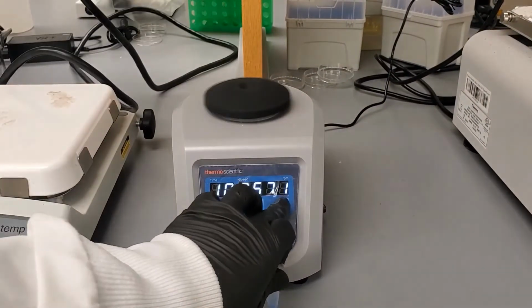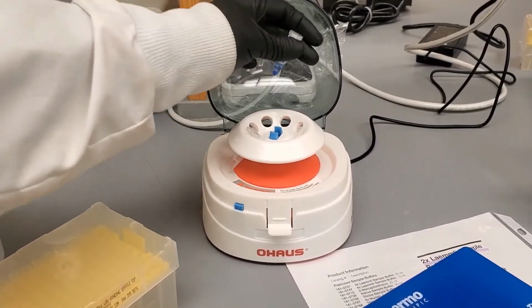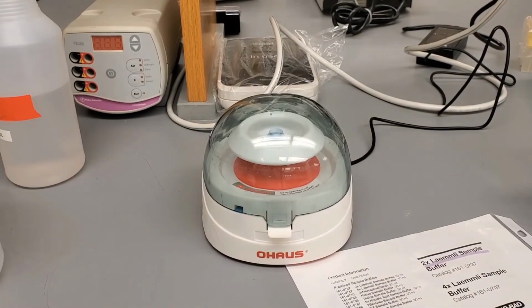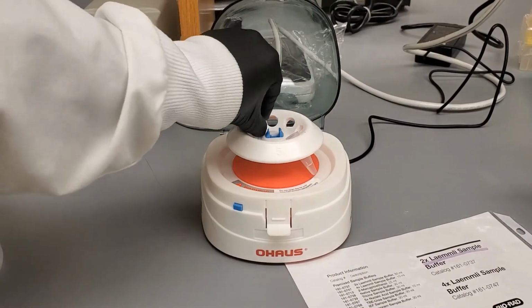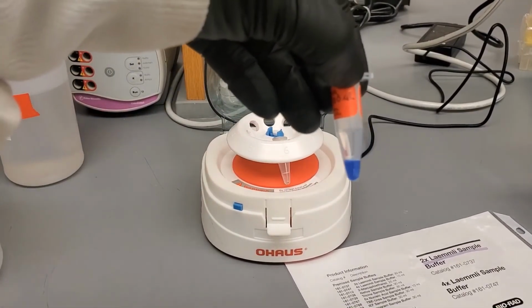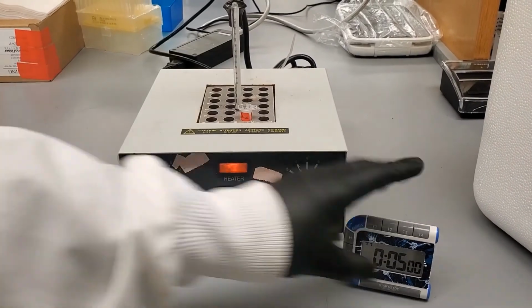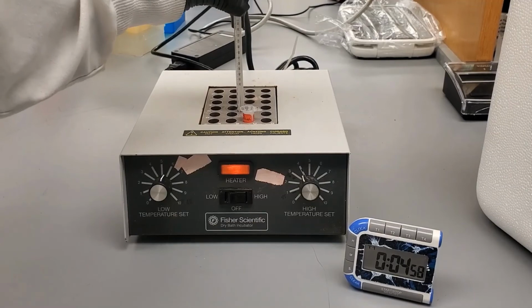Vortex quickly, and after vortexing them, briefly spin them down. Now we can go ahead and denature our samples for 5 minutes. Okay, put your sample here, 5 minutes, and we have it at 90.